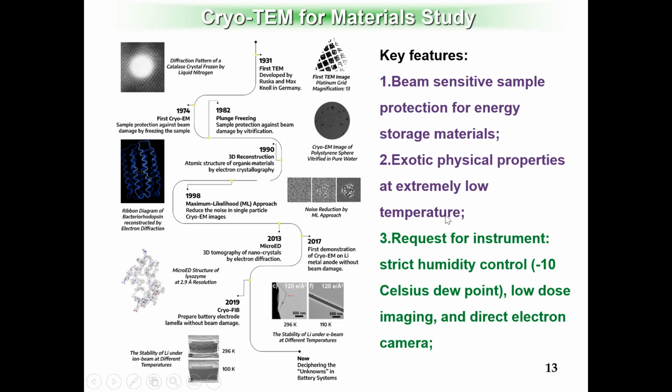And the third thing is that you always need to check the instrument requirements. For cryo-EM, the setup is much, much heavier than a normal TEM because of the thermal vibrations and drifting.